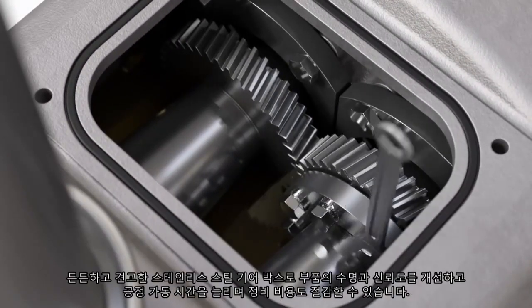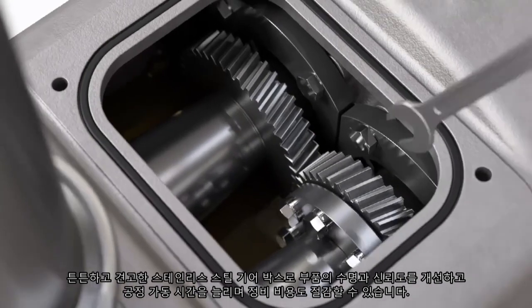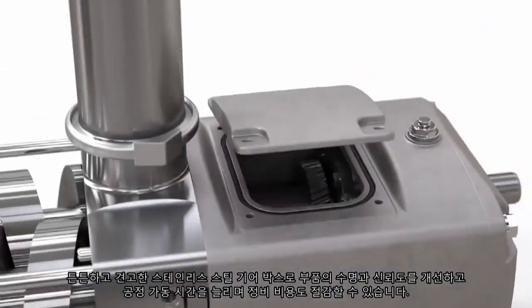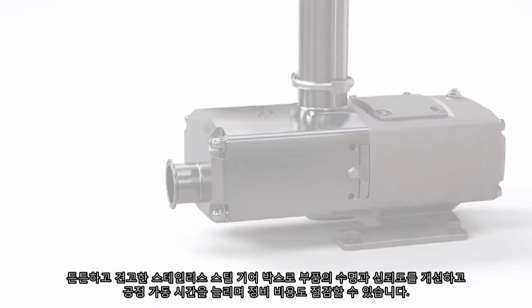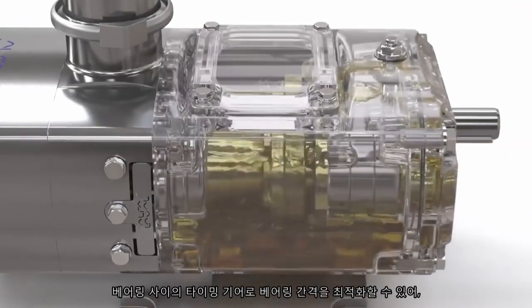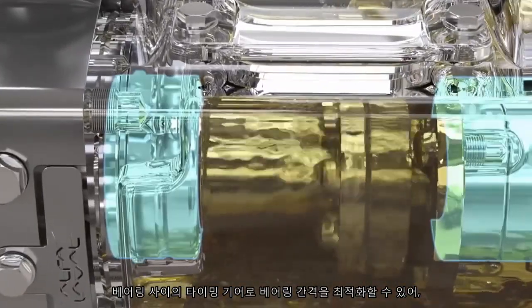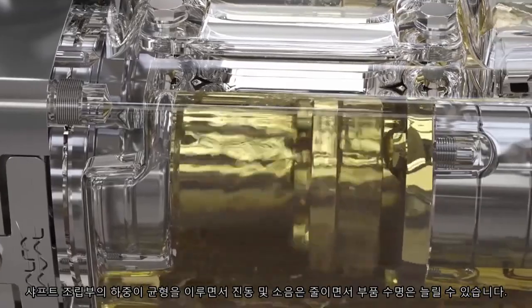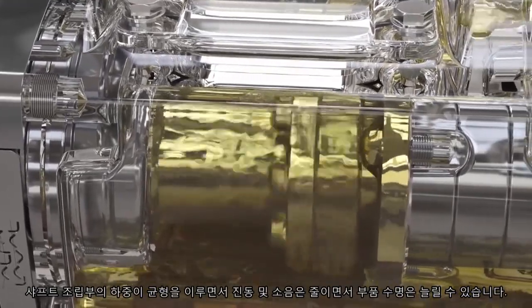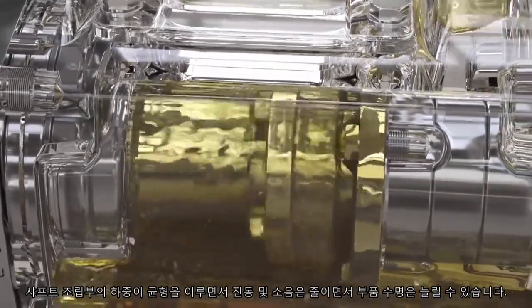A rigid and robust all-stainless-steel gearbox prolongs component lifetime and reliability, increases process uptime, and reduces maintenance cost. The timing gear is located between bearings to optimize the bearing span, which balances loading on the shaft assembly, reducing vibration and noise and further extending component lifetime.